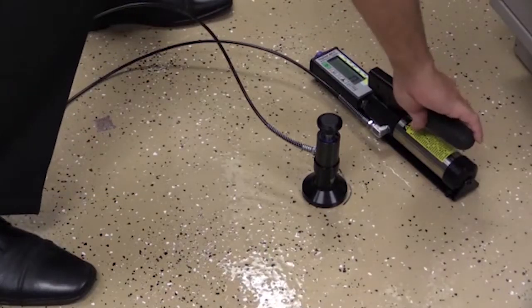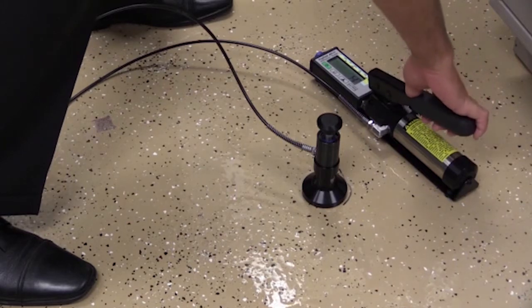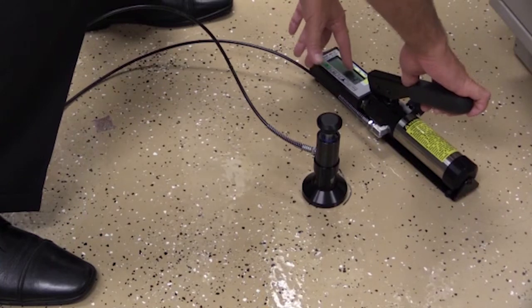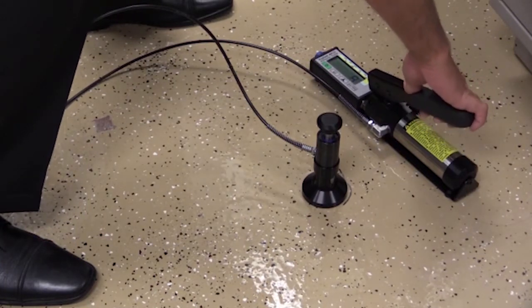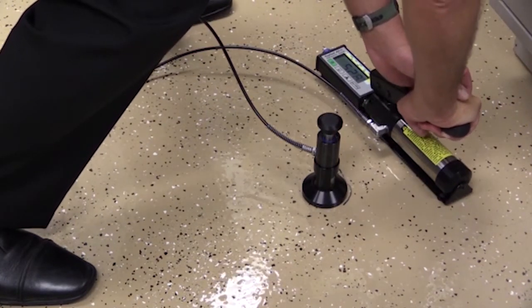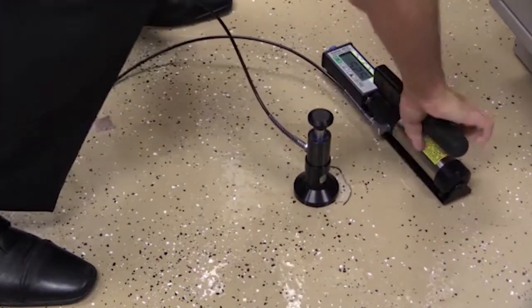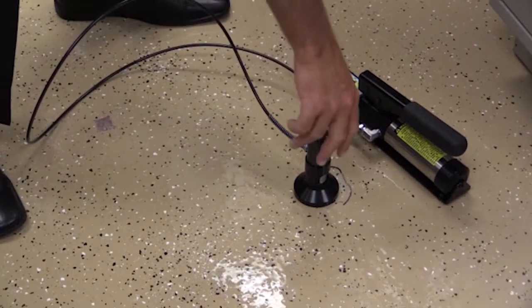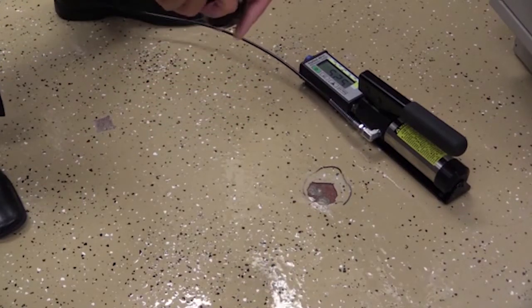Begin to pump until it catches hold of the pull stub, and it will monitor the rate of pull up here along the top. You don't want to exceed 150 PSI per second. The pull-off result is 525 PSI — then rate the location of the break.